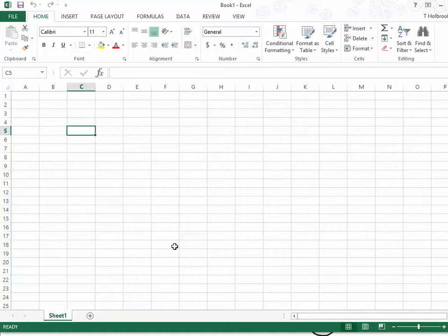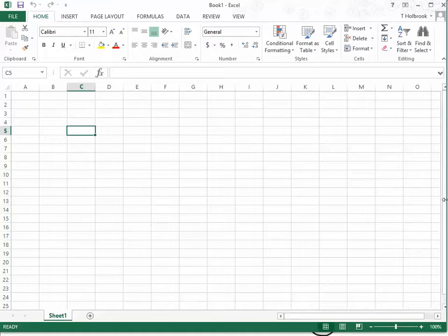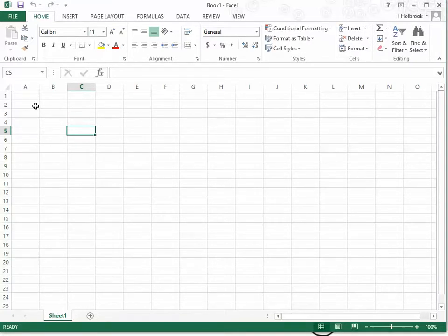Excel is a very powerful tool that we use, especially later in the program. So we will become very comfortable with Excel when we go through these steps and processes. What Excel will allow me to do is any calculation that the calculator will do for me, Excel will do as well. And it also allows me to generate graphical representations of data that I take in a laboratory environment.